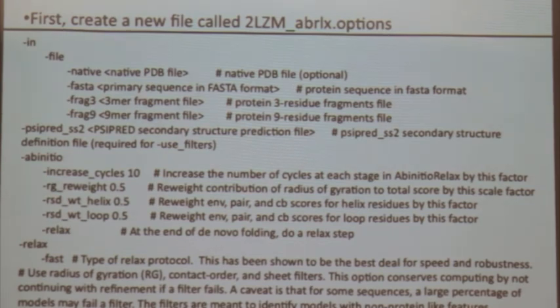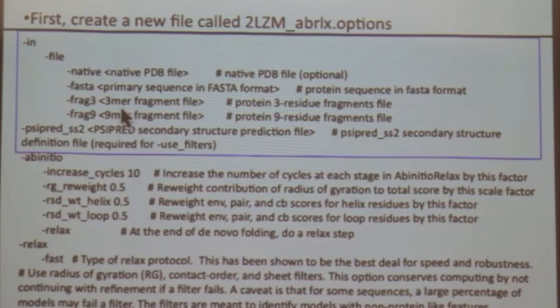And then the next part is setting up an options file for running Rosetta. This is the instructions for the AbinitioRelax application. What do you want the program to do? So first you have this section, which is the input files. Notice the format, so -in, -file, and then -native. This is the same as, you might see another format of this. So if I say -in, and then -file, -native, and then my 2LZM.pdb.